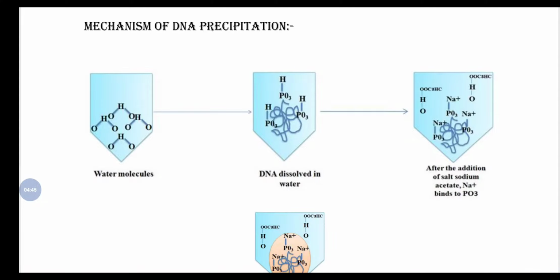Alcohol is one of the essential ingredients of DNA extraction. We have already seen this. It is used not only for precipitation but also for storing and washing of the DNA. If we want to remove impurities, like the salts we are using, we remove that salt from the DNA so that it won't hinder applications like PCR.